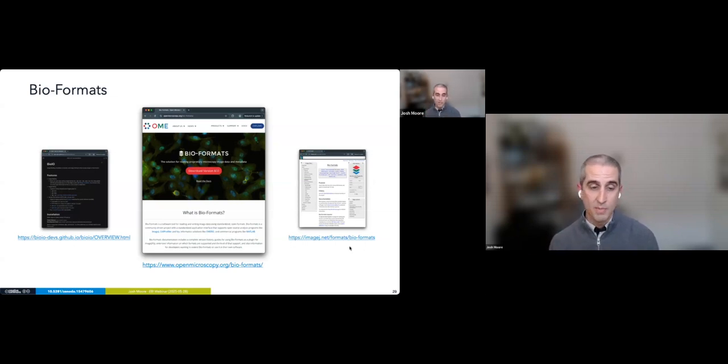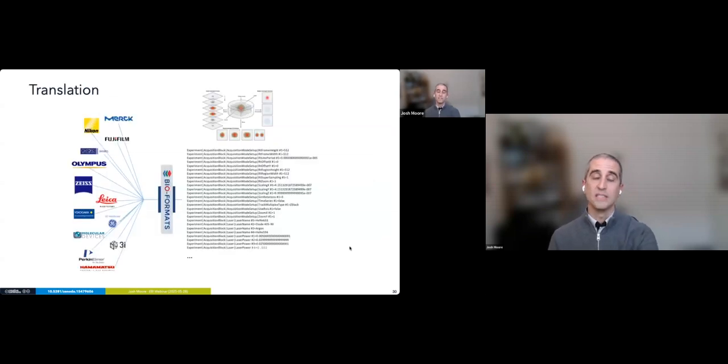It's also shipped inherently in ImageJ. So if you're working with ImageJ and opening files that are complex, quite possibly you're using Bio-Formats even without knowing it. And what it does is it sits in the middle between all of these many file formats. It's some 160 plus file formats. I didn't get an updated number. And it maps all the binary data and the metadata it can into the common model, and all applications are welcome to use it. And then there's a bunch of other metadata that we don't necessarily know what to do with. We can't parse it. We try to show it to end users and we just print it out so that they can understand what's going on.